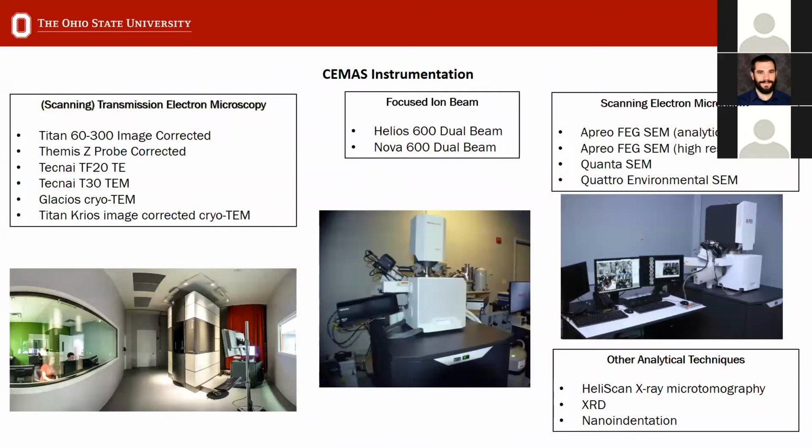On this slide, you see the instrumentation that we have available at CEMAS. And today we're going to focus on the Glacios cryo-EM.